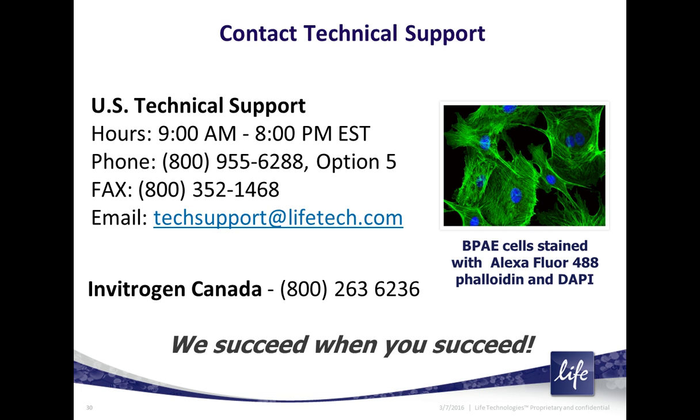I've had very little luck trying to develop a live cell antifade here, so I won't go into detail on that. There are some homebrew recipes available online. Most commonly, people will use Trolox, which is a water-soluble vitamin E analog, I think, if I remember correctly. Sometimes people will use other vitamins, like vitamin C, for instance, or ascorbic acid. I've had very little luck with those. For the most part, they don't protect the dyes very well.